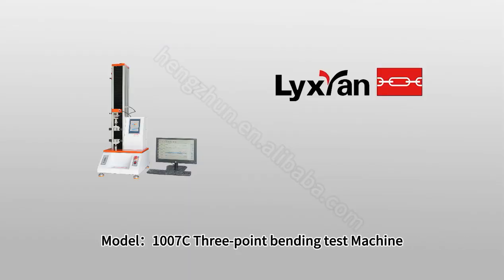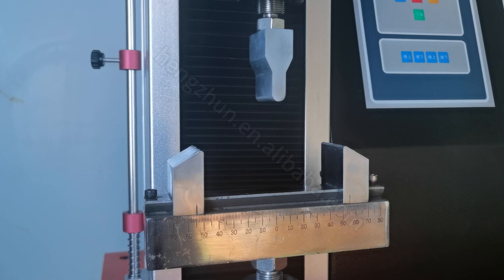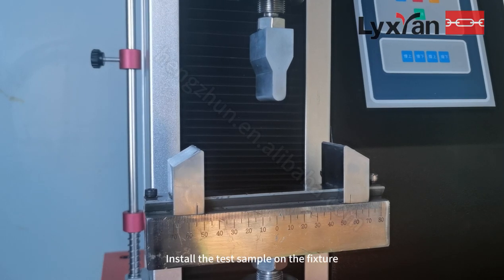Model 21007C 3-point bending test machine. Install the test sample on the fixture.